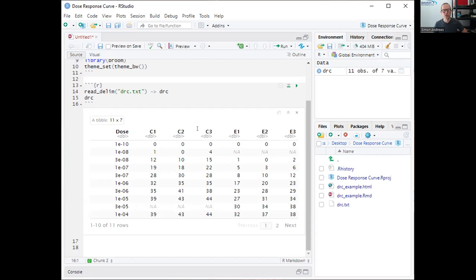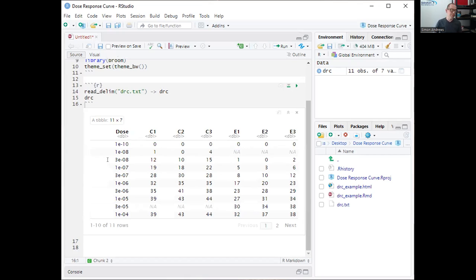We've done six experiments: C1, C2, C3 and E1, E2, E3. The C and E are our two experimental conditions — control and experiment — and 1, 2, 3 are just replicates. We have a response value associated with the different doses. To add some complexity relevant to real data, we don't have all doses measured in all samples — some values are NA — because in some experiments different doses were used than in others. We'll need to deal with that in our data manipulation.